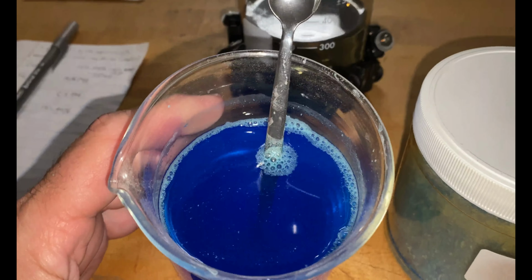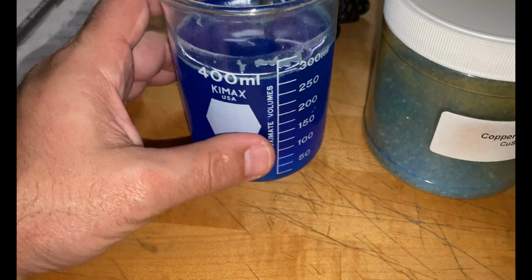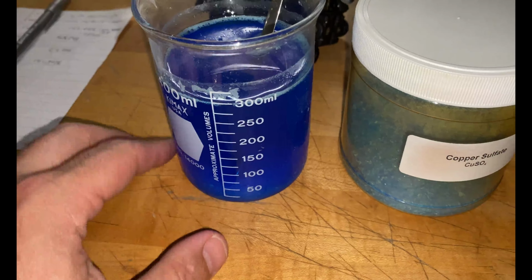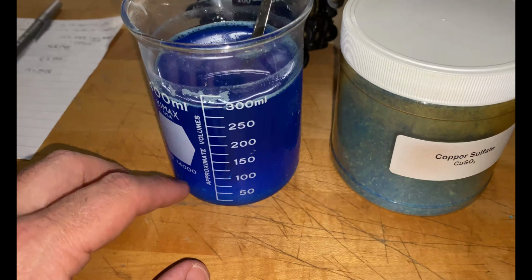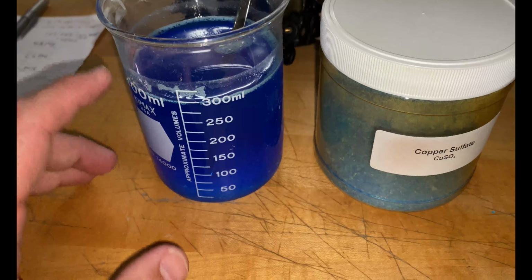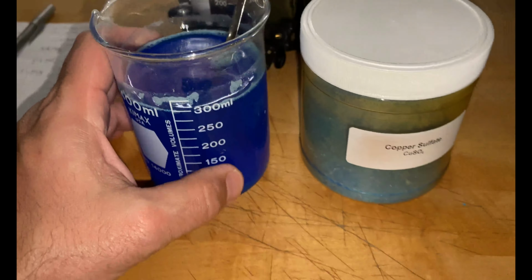Okay, so after warming some pure water and rainwater actually, and mixing in this 159 grams of copper sulfate, let's turn to this beautiful blue color, blue vitriol.